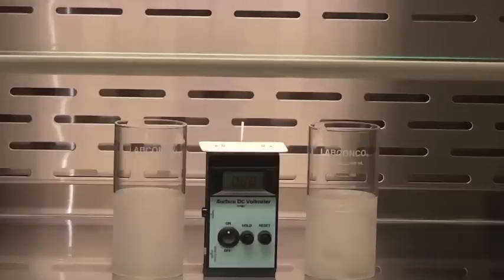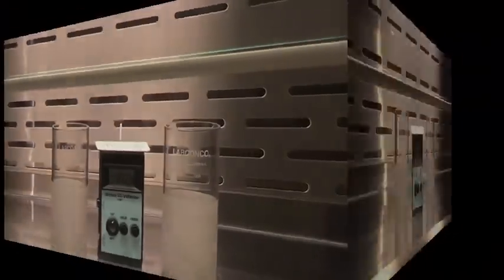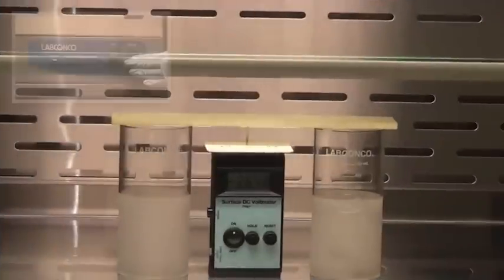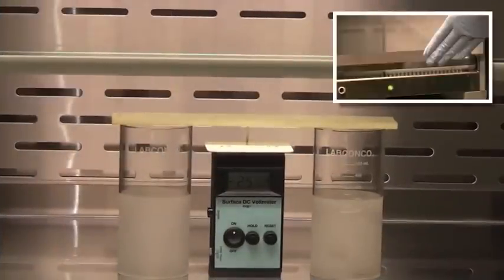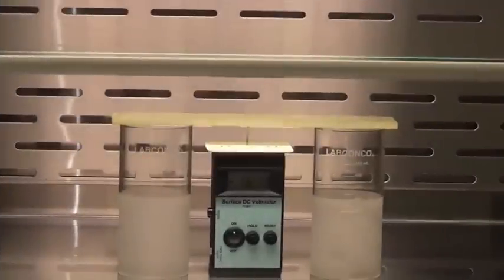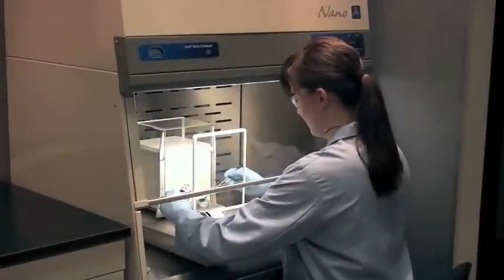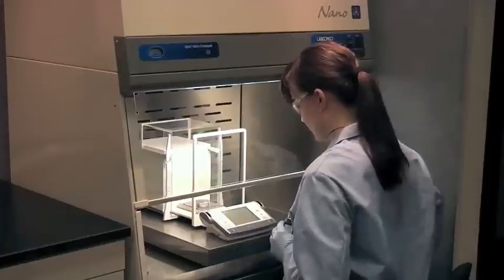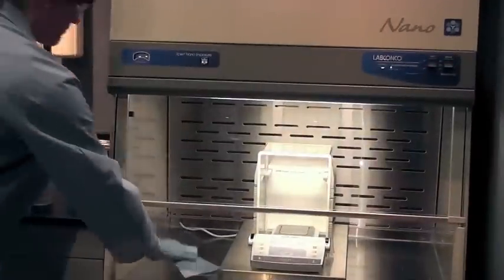A static meter measures the field intensity of electrostatic charges. Notice the display and watch as the ionizer is engaged — note the dramatic decrease in field intensity. Not only does stainless steel lend its inherent static-dissipating properties to the unit, it also lends itself to easy cleanup.